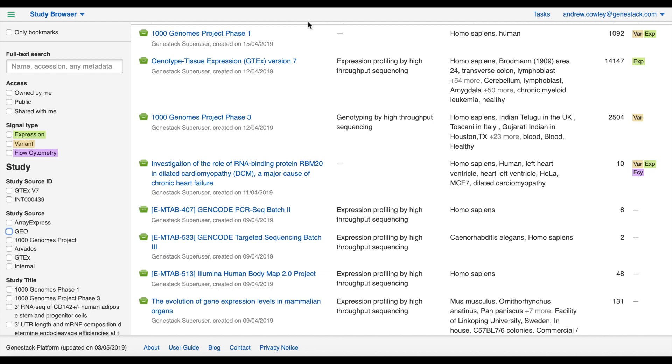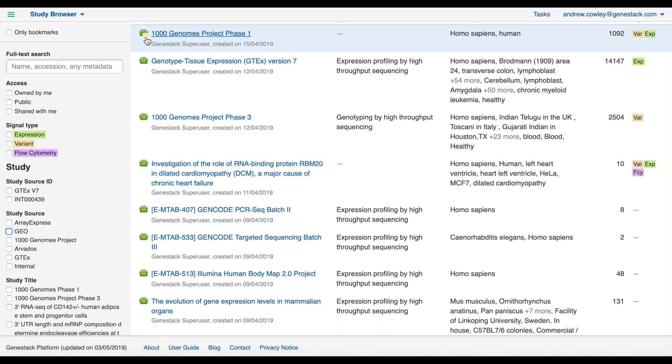Looking at the main panel, we have several columns. The first column displays the name of the study and you can click this to look at the study in more detail. We'll do that later. It also lists information about which user created or imported the study and the date.